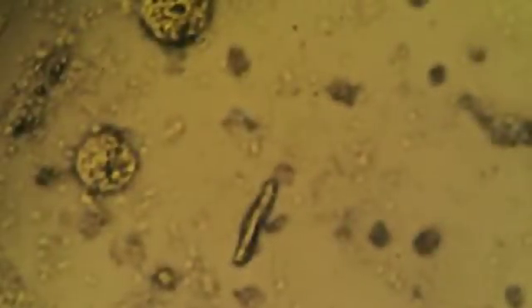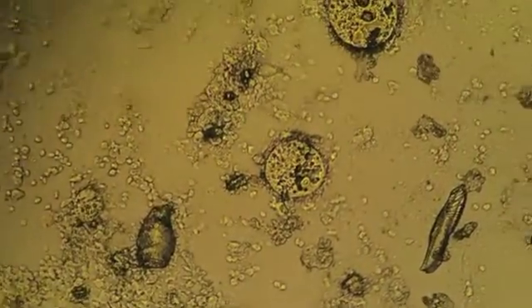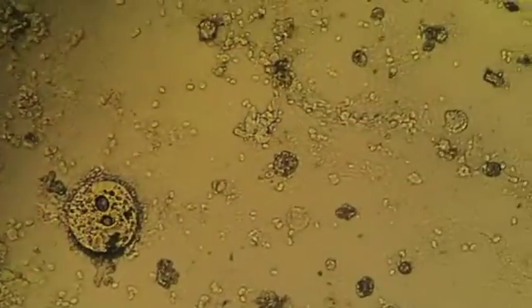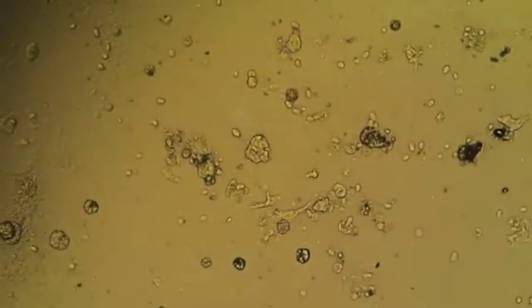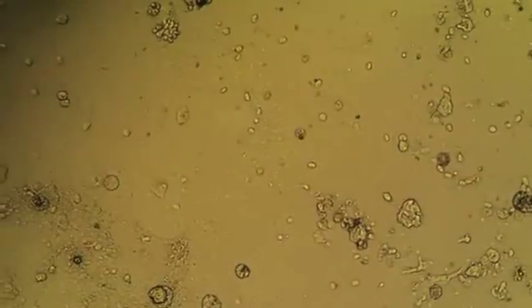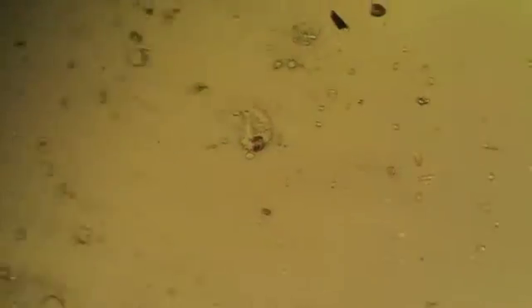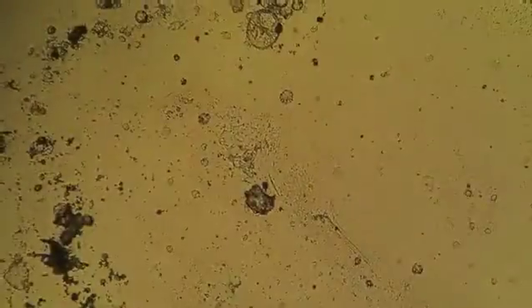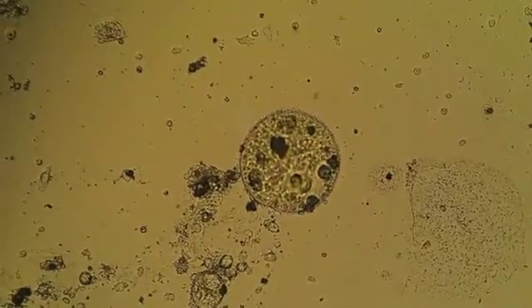If we zoom in on them — there's one right in the centre of the screen, another one there, and more of them all the way around. You can notice that they are actually larger than the host cells. The host cells are these smaller, refractile pale cells — these are red blood cells that have come loose. So this is what's known as white spot disease.